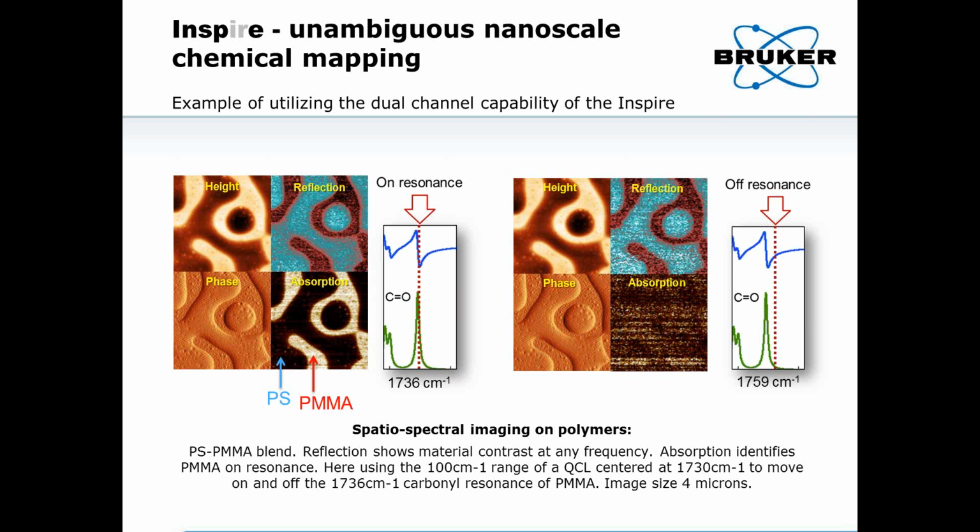Now the left series of images are obtained at the infrared resonance of this material, the PMMA material, the calculated spectrum of which is shown in the white box here.